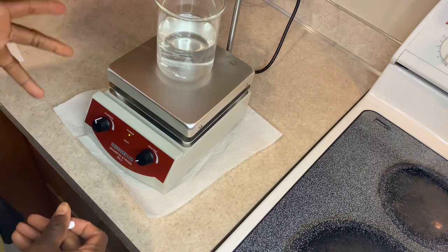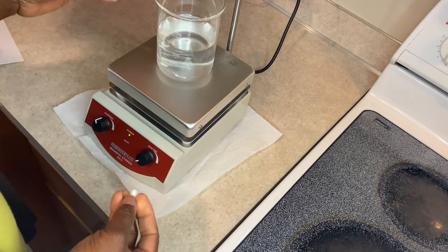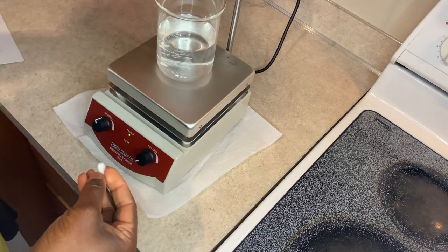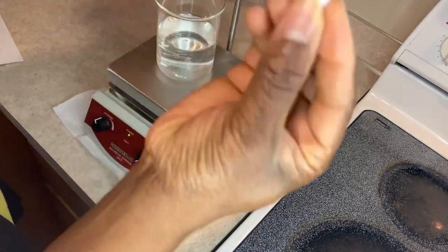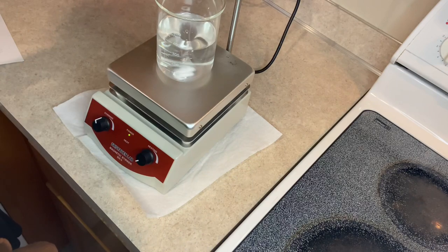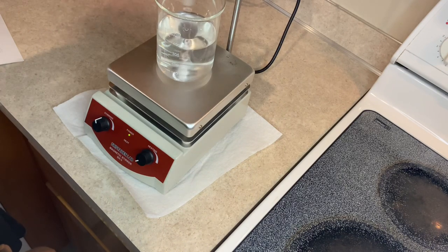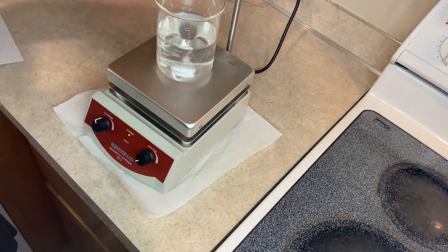So right now it's just stirring — I have not turned the heat on. I can also turn the heat on, but what I recommend is to make sure you put this stirring bar in your liquid first. See, it's stirring and the water is at room temperature.